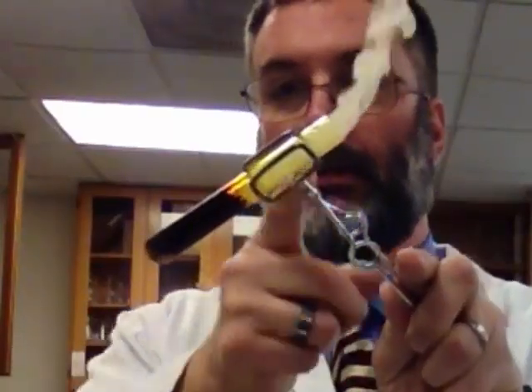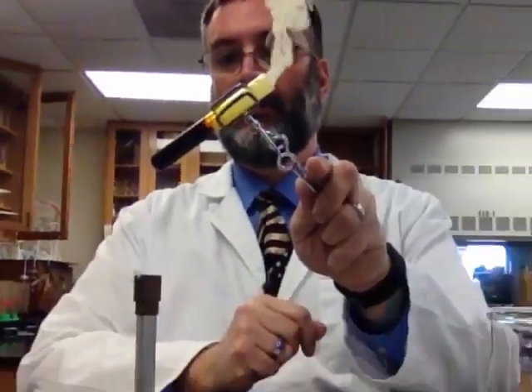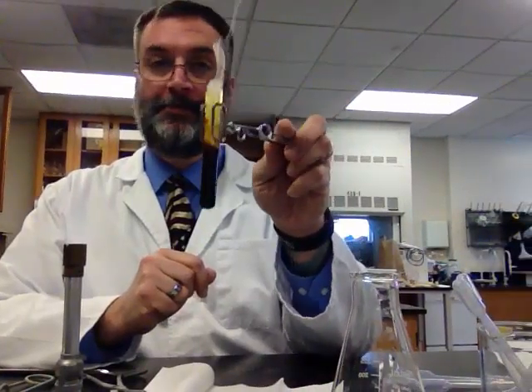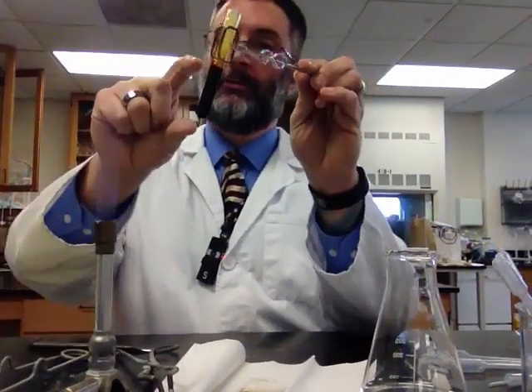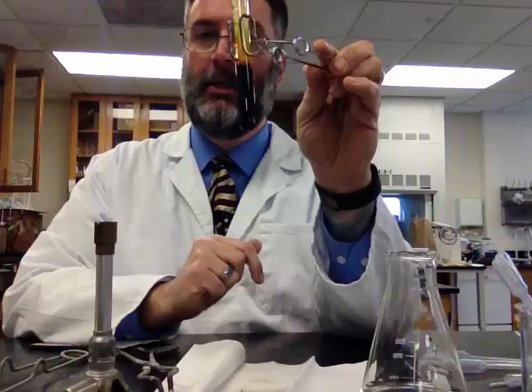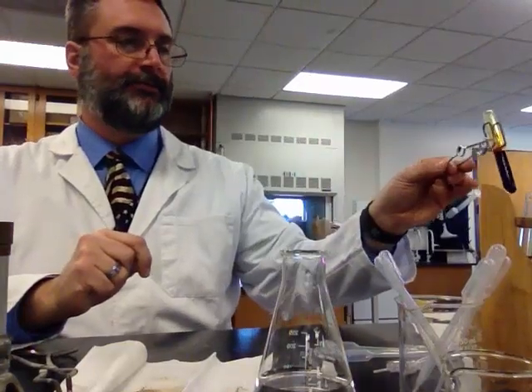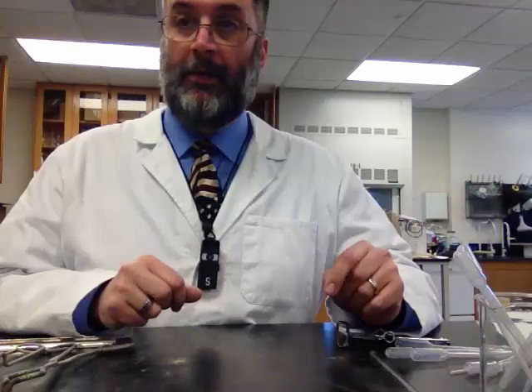What do you see? Look at the color changes. Look at this stuff. How about that? That's a pretty impressive color change, isn't it? Started out as just a little bit of white powder. Now we've got this sort of liquidy stuff, black colored liquid. We had some smoke. We've got a yellowish color towards the top of the tube. Very dramatic change. Ready for the next one?